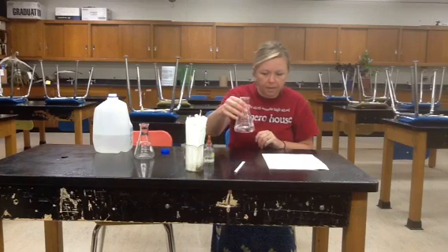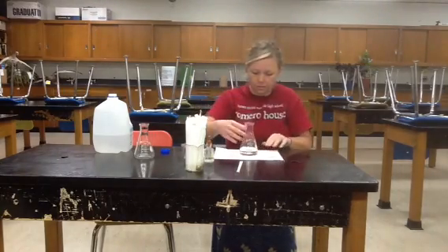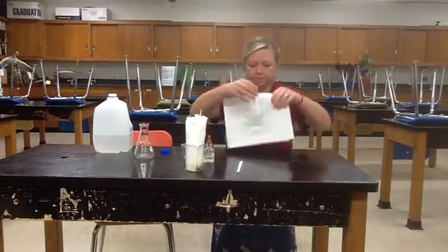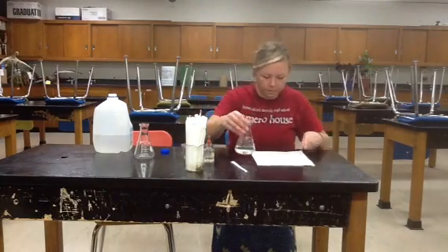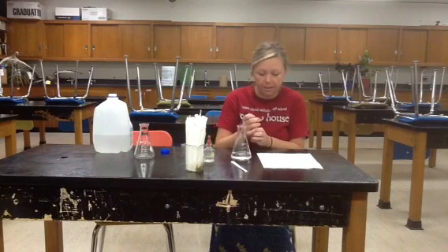It says if the solution turns pink, a very slight pink, you can assume that there is a little if any, carbon dioxide dissolved in the water. Okay, so there's no carbon dioxide dissolved in this water. You can place a white paper behind the flask just to make sure that it's clear. And it is. It's clear. If the solution is colorless, which in our case it is, we're going to add sodium hydroxide drop by drop to neutralize the carbonic acid until it has a light pink color.